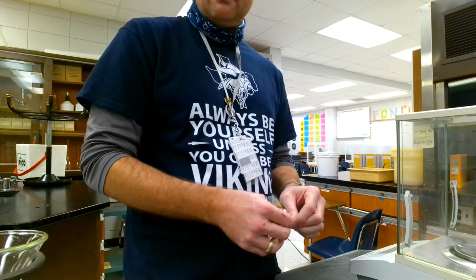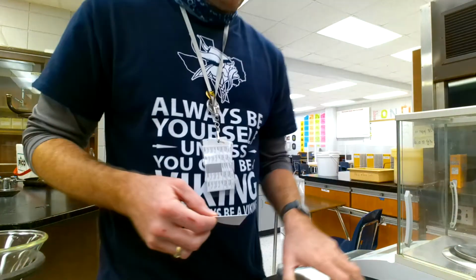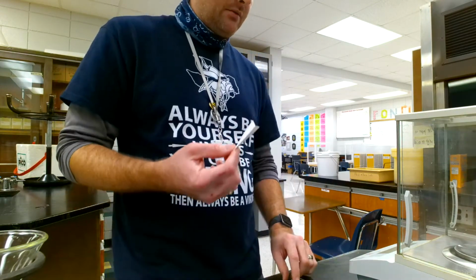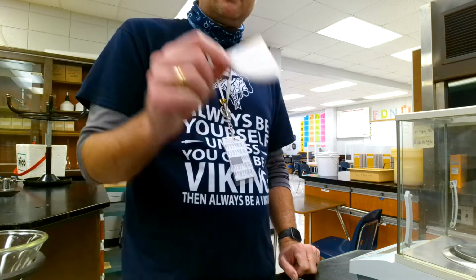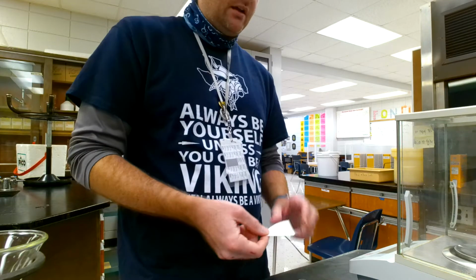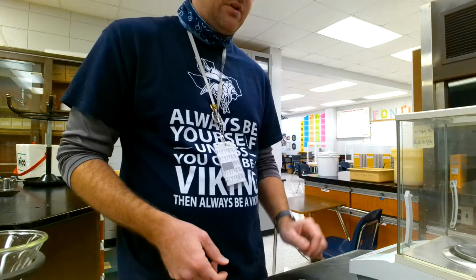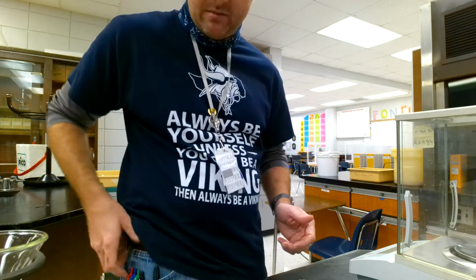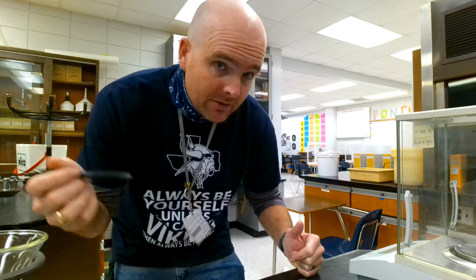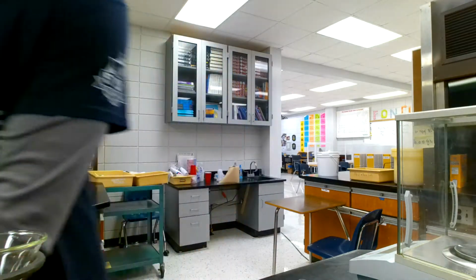Now you want to weigh this filter paper, and I'm going to weigh it right now, because we're going to have our product in this filter paper at the end, so we want to be able to subtract it. Very good practice is to always weigh the mass of your filter paper, even if you may or may not need it. This one is 0.78 grams. Did you hear me? 0.78 grams. So I'll write that one down.